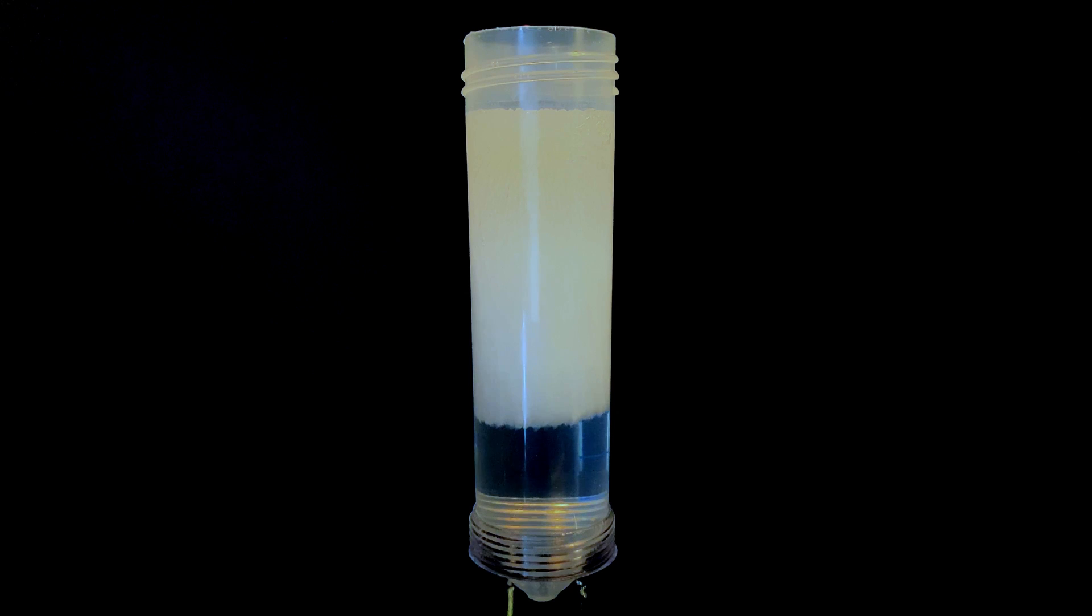So when the liquid just barely touches another crystal, it sets off an unstoppable chain reaction that makes the entire solution crystallize in seconds.